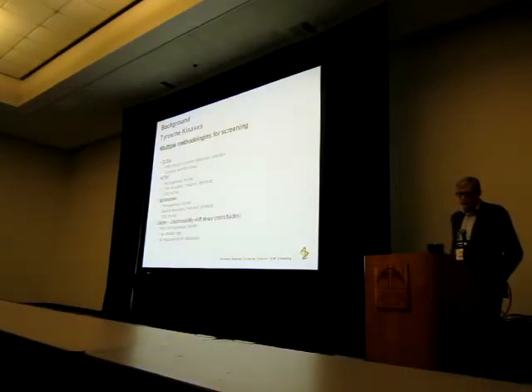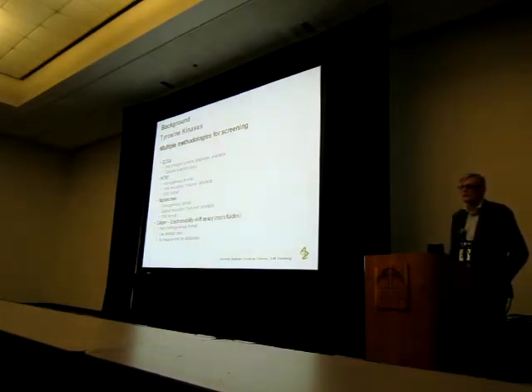And as I'm sure you're aware, there are multiple methodologies that you could use for those kinases. And actually, I've worked on all of these. So when I first came to AstraZeneca, we ran a kinase screening panel that was made up roughly 50-50 of tyrosine kinases and serine threonine kinases. The tyrosines, we used ELISA methodologies to look for inhibitors, and for the serine threonine kinases, we used the classical radioactive filter capture type assays.